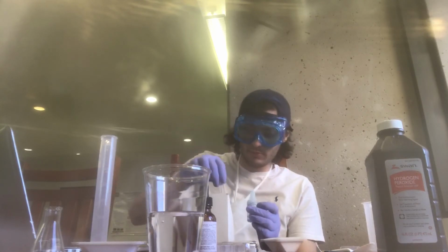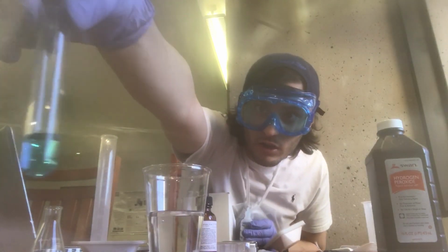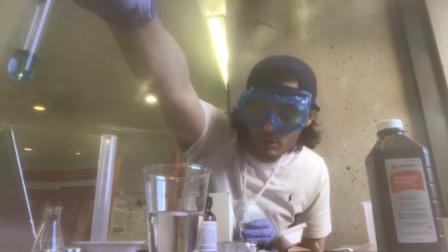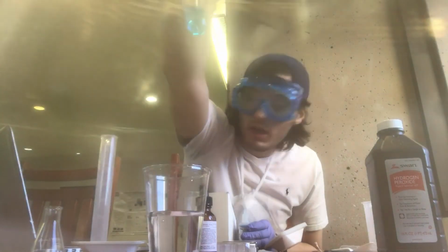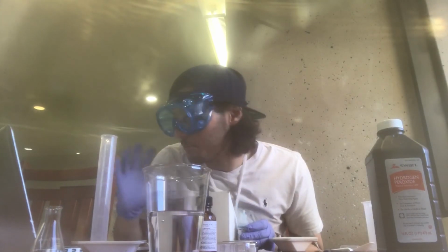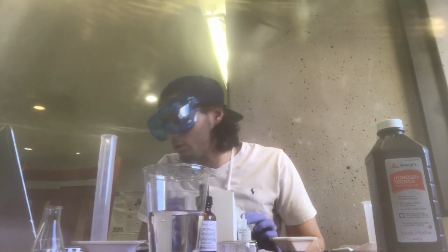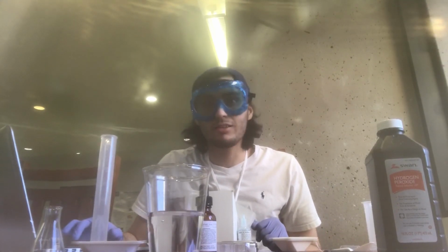Here is the 2 ml, or the 40 drops, and as you can see, it is labeled 1. I'm going to go ahead and do it for the other 4 test tubes, and I will let you guys know how the experiment goes. I will be right back.